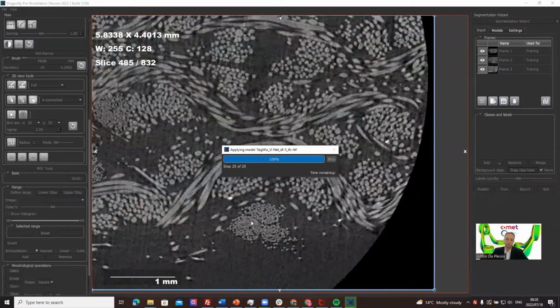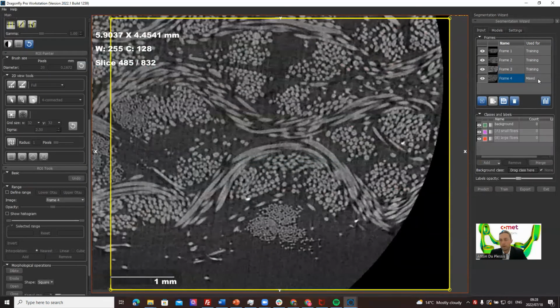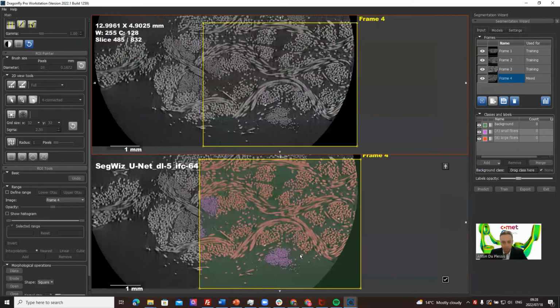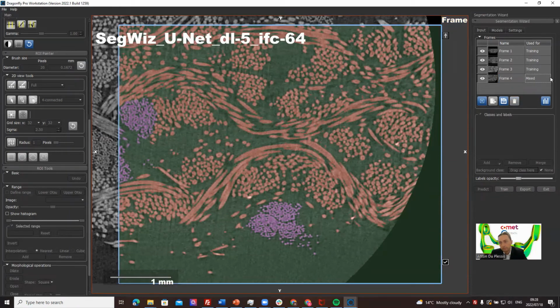monitoring frame, because here we see clearly small fibers, there's some small fibers, and large fibers are quite clear. So let's see how the model can be trained better on this. So let's have a look at what is the current prediction. Actually, the current prediction is quite good. It's making a mistake here. So let's see if training a new model would fix that up.